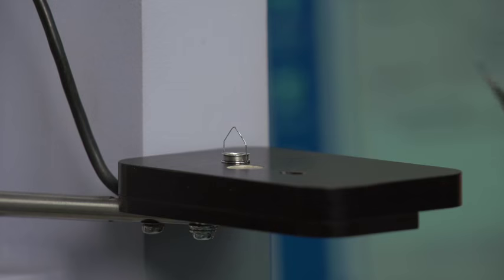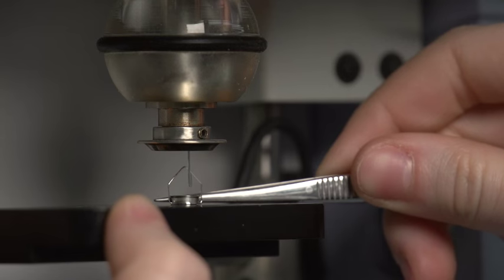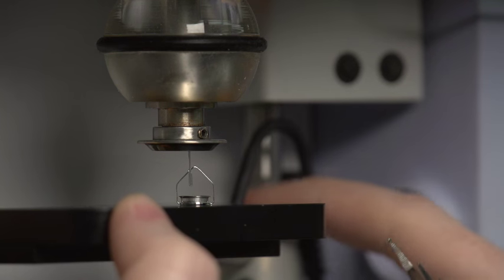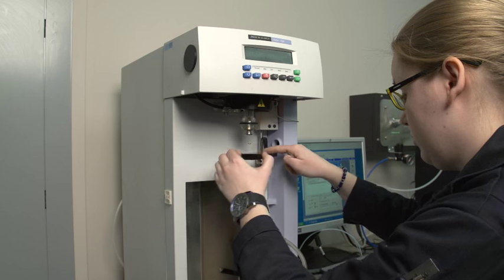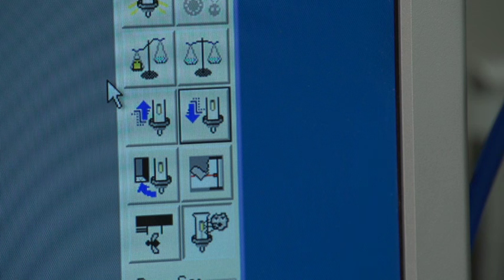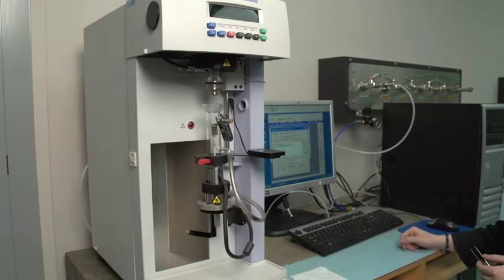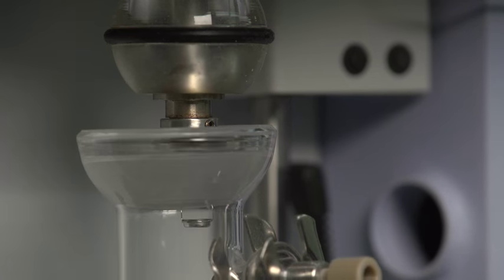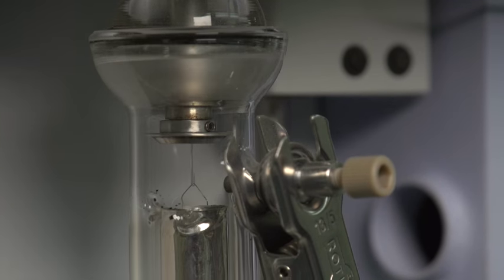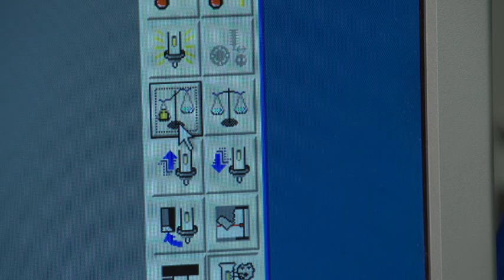Return the pan and stirrup to the platform. Push the pan and stirrup so that the stirrup is over the balance hook and lower the platform. Swing the platform out of the way to the right-hand side. Push the Raise Furnace button. Check to make sure the pan and the stirrup are swinging freely. Press the Read Weight button.